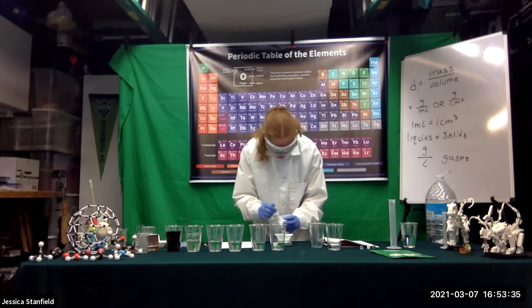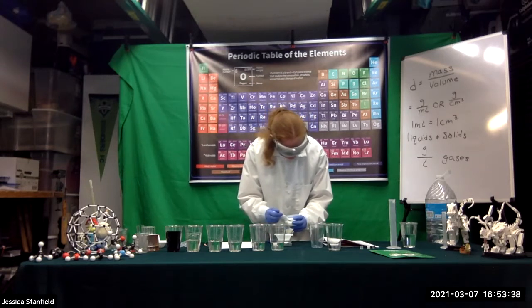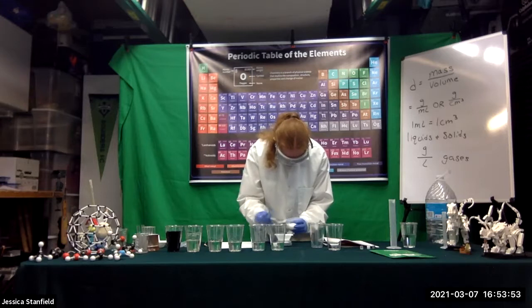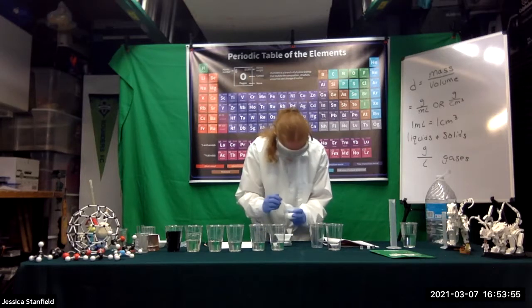Okay, so that spoonful is 3.53 grams. My instructions say I need 5.5 grams. That's 5.25, so I'll go a little slower. And there we go.